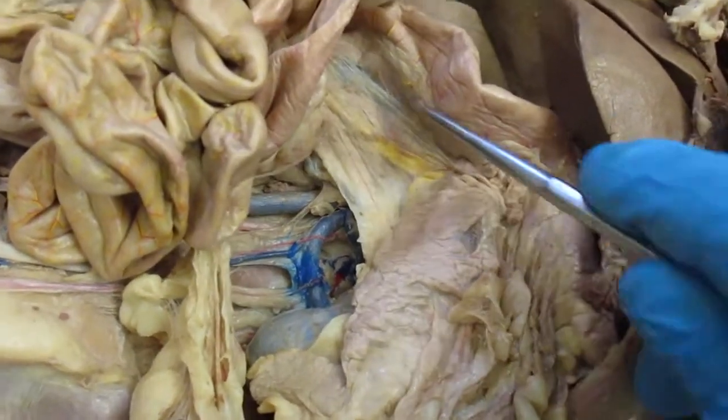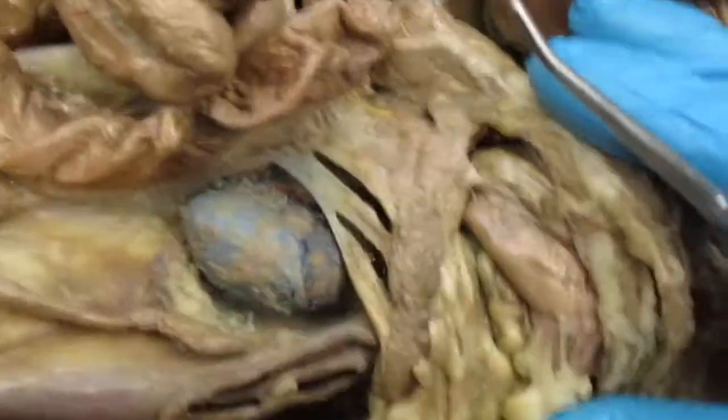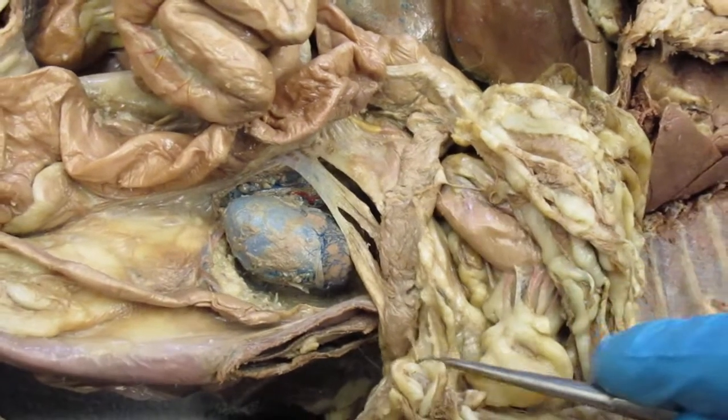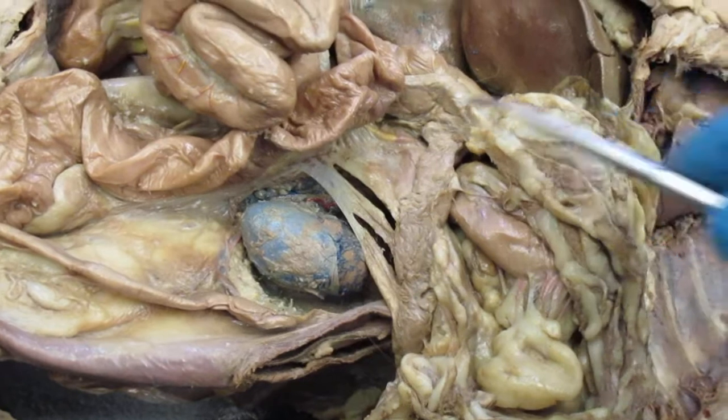So there's your pancreas. On this cat here, let's see if it's better here. So we can pretty much see the same thing here. So here's your pancreas right here. Here's your pancreas. Okay.